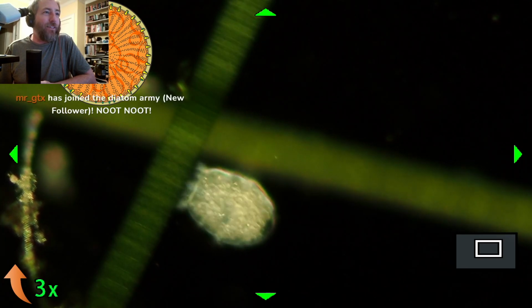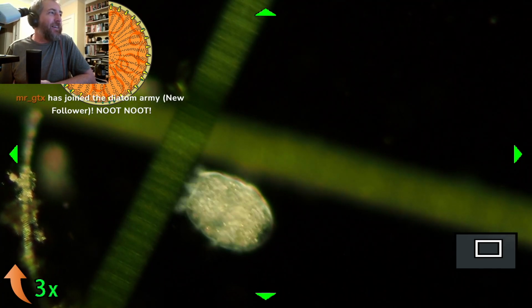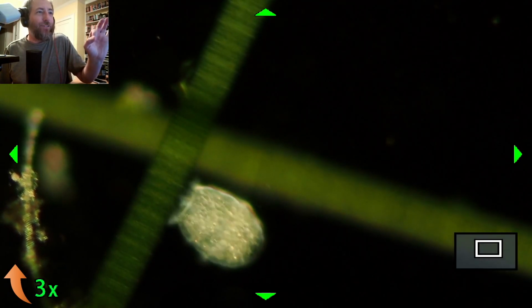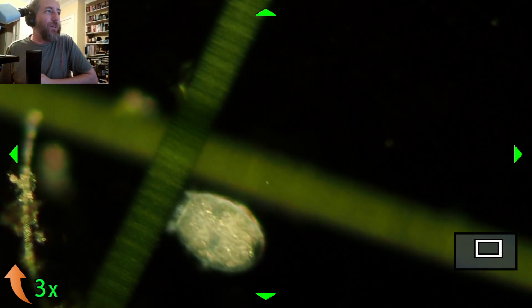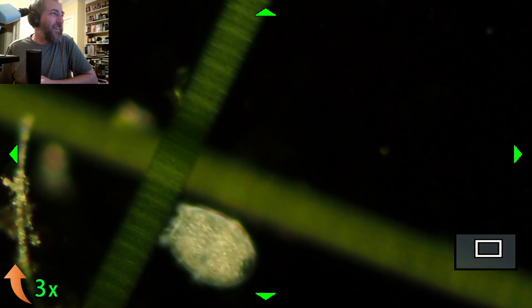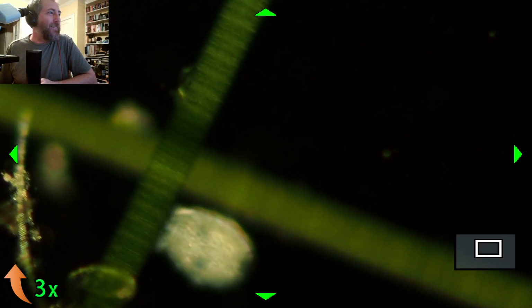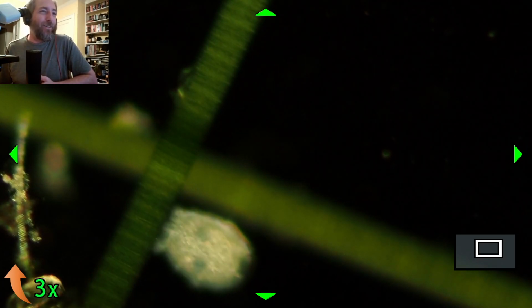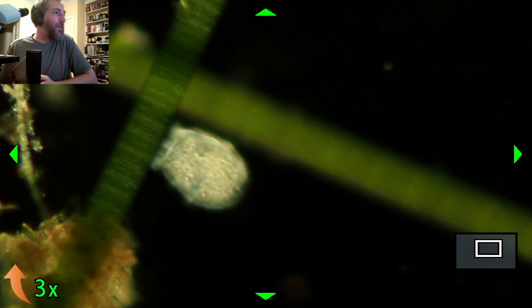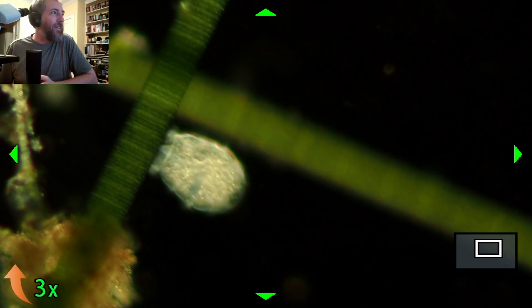I like that because it means it's not going to go anywhere. And it's some sort of ciliate. It was sitting sort of perfectly vertical, so we could only see the circle part with the cilia spinning. This one's just stuck, so it hasn't realized that it's stuck, I think. And it thinks it's moving through the water. They don't have eyes, so it's doing its best to move forward, and it's stuck. Yes, my objective is to mesmerize people, also to memorize them with a bag full of stars. And it seems to be working.